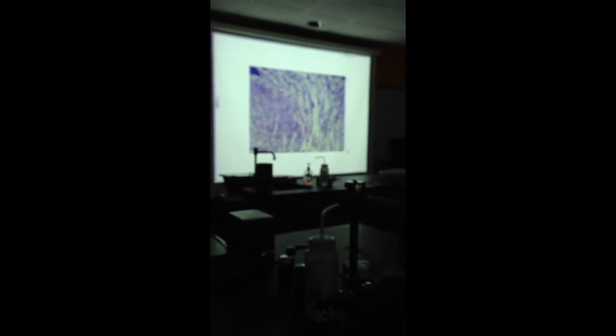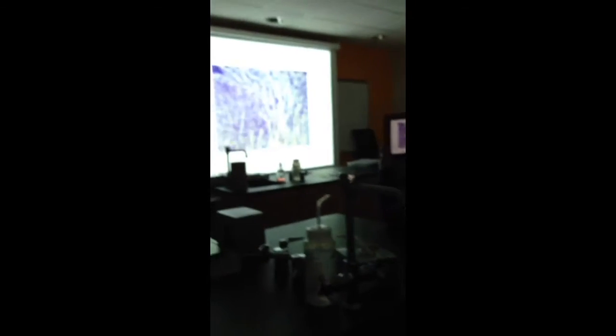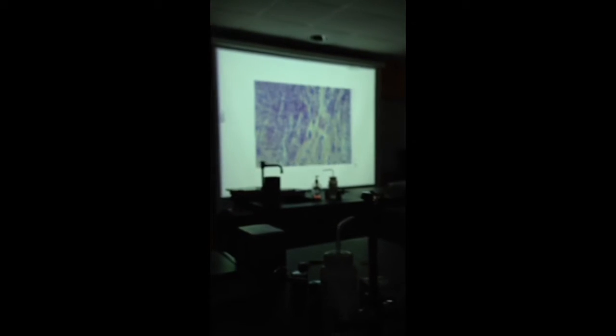Got the epithelium that covers most of the surface of the tongue. It also lines the oral cavity, the oral pharynx, the laryngopharynx, and the esophagus. You can see it here. What kind of tissue is this? Mentioned last time. Stratified squamous. Non-keratinized, stratified squamous epithelium.